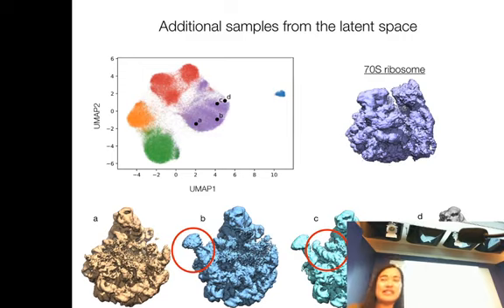Yeah, so answering the second question first, one thing about this method is that we train a separate model per experimental data set. So for each new cryo-EM data set, we're training a separate model, and we don't really expect it to generalize to unseen protein structures or proteins that aren't in the particular data set. Although it is an interesting question of whether we can take advantage of all the protein structures that we know now through cryo-EM.